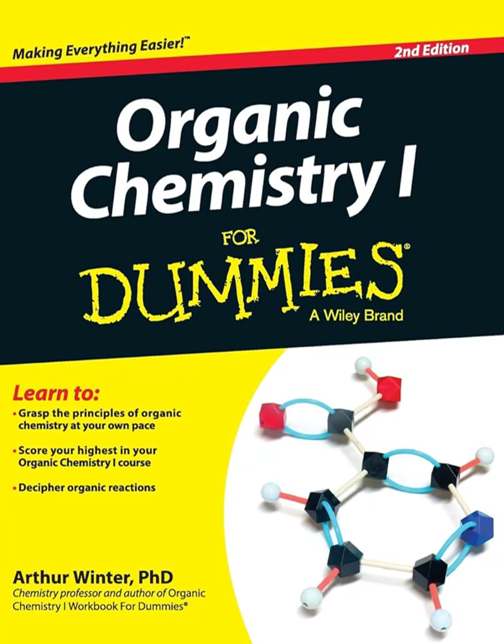Okay, so that gives us the relative ratio. How do we get the absolute number of hydrogens for each peak? Good question. You sum up the numbers in your relative ratio. Let's say it adds up to 5, like a 2 to 3 ratio. Then you look at your molecular formula. How many hydrogens does it actually have? Let's say the formula says 10 hydrogens. Right. Our ratio sum, 5, doesn't match the total 10.